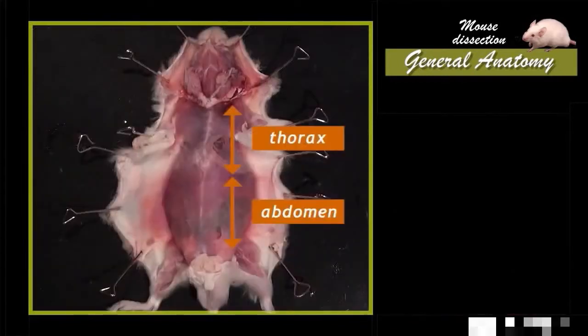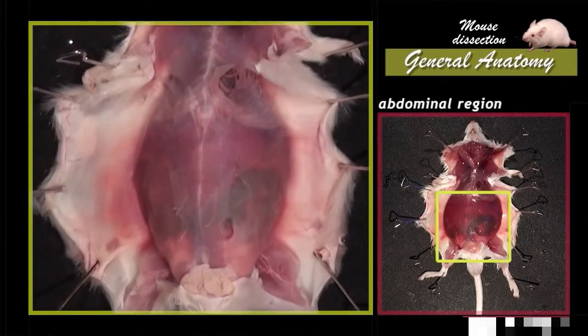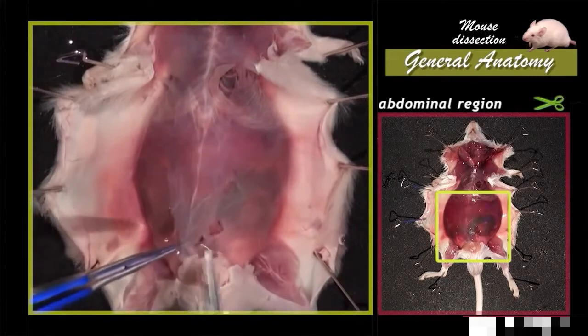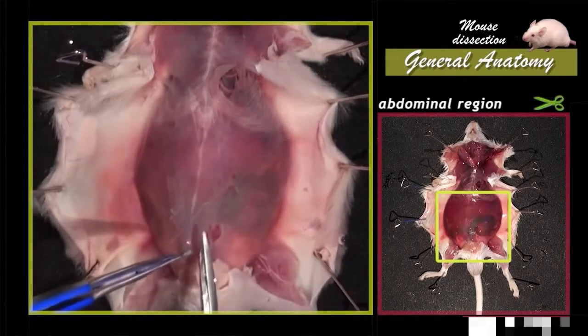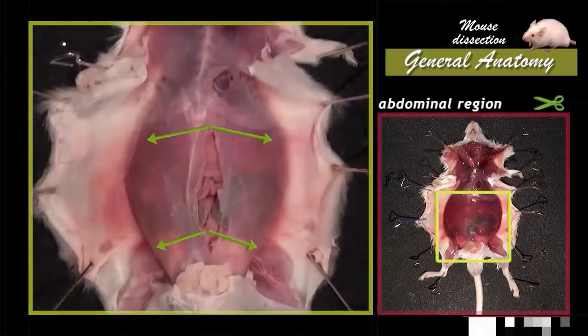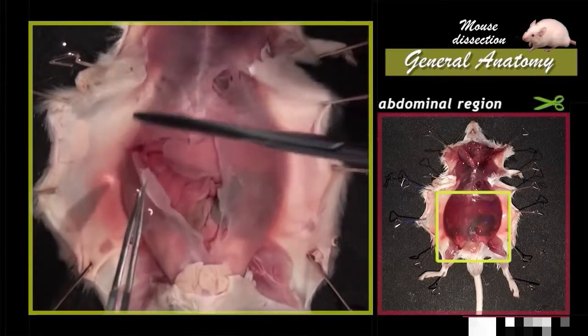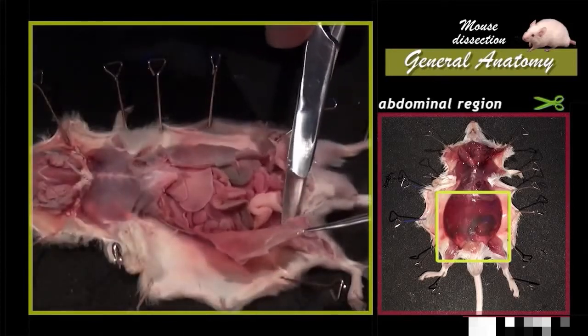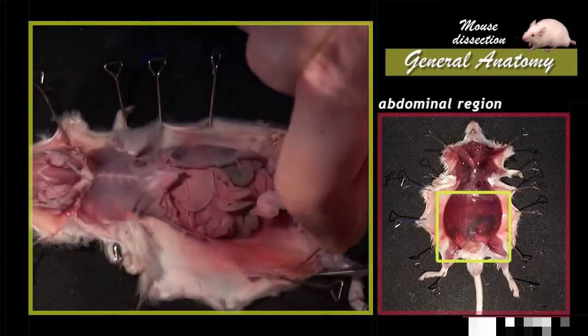At the trunk level, we distinguish two regions: the thorax and the abdomen. The abdominal cavity must be opened to highlight the organs in place. Abdominal muscles must be lifted and incised up to the base of the thorax. Then, two transversal incisions are made at this level to complete the abdominal cavity opening. Muscular foldings are pinned on the sides.